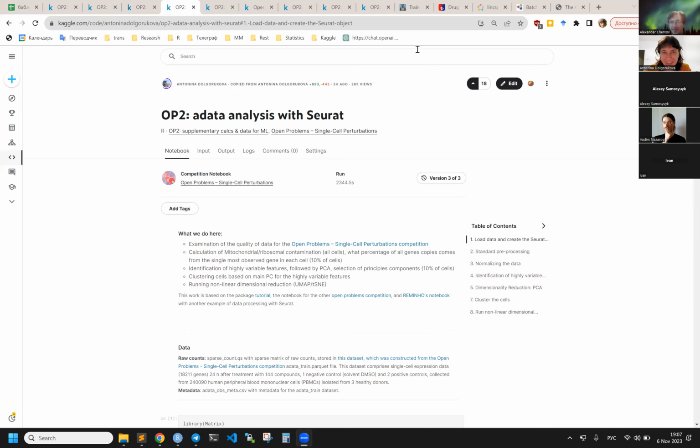I'm going to share my public notebook, just elaborate a bit on the analysis I've done with the Seurat package, which is a specific package designed for quality assessment, analysis, visualization, and other exploration of single cell data.